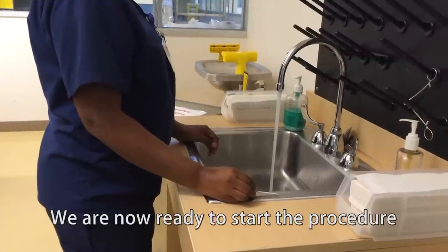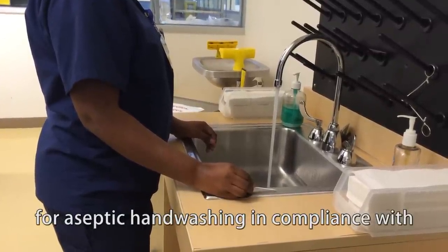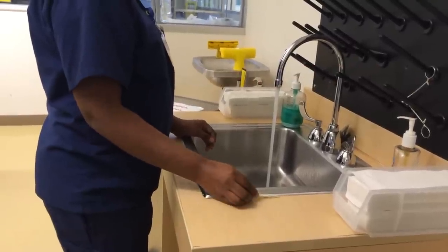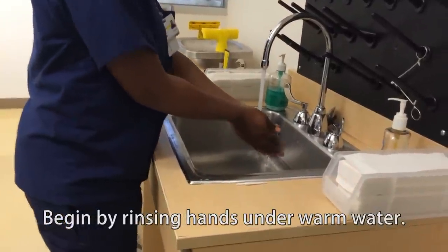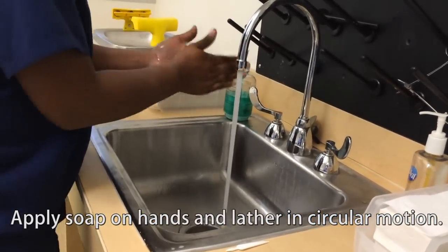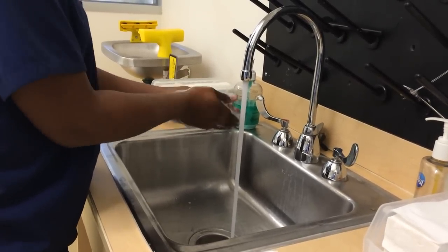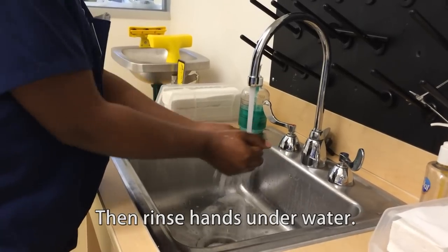Now we are ready to start the procedure for aseptic hand washing in compliance with USP 797 guidelines. Begin by rinsing hands under warm water. Apply soap on hands and lather in a circular motion. Then rinse hands under water.